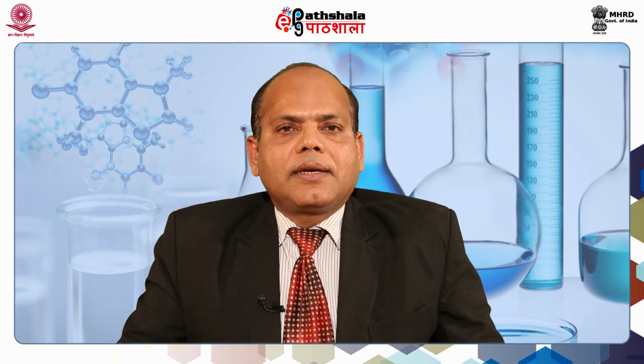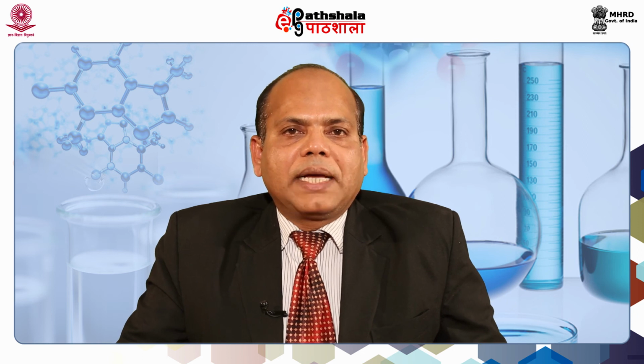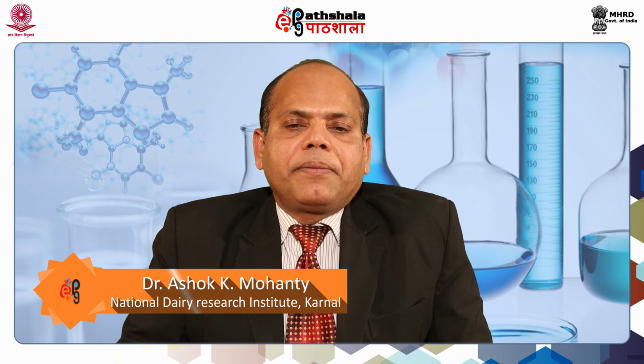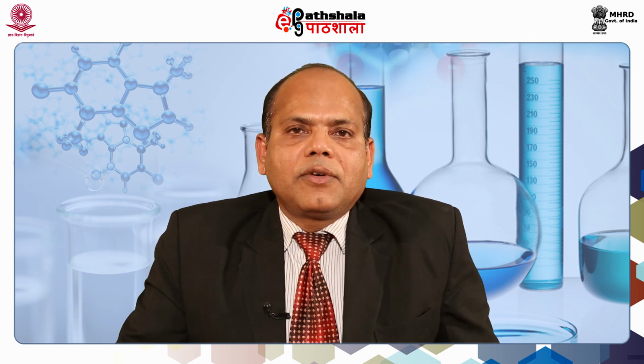So, students, till now we have discussed the principle of mass spectrometry. Just to give an overview of this: first of all, we have taken the samples, then those samples have been prepared and generated into small molecules.